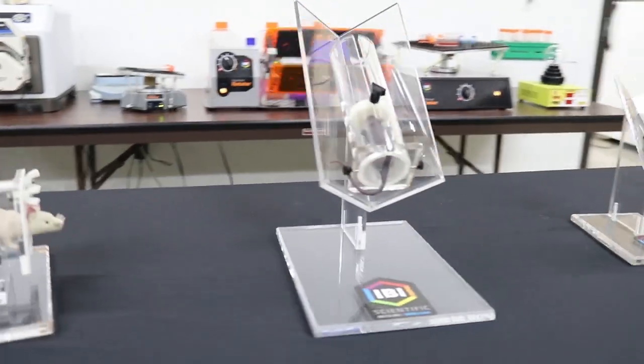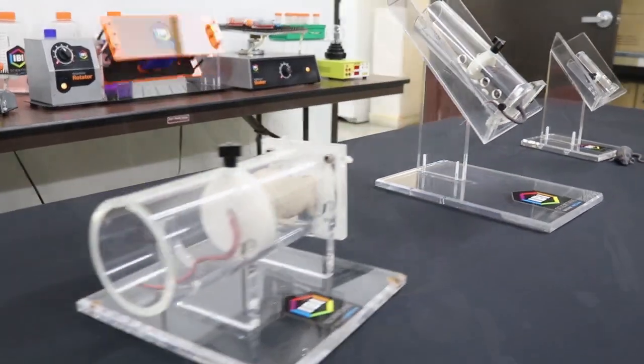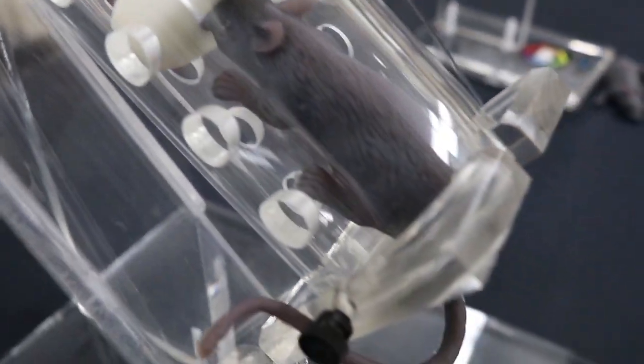The rugged restraint tube is manufactured using a quarter inch thick extruded acrylic that comes in variable diameters from one inch up to three inches.